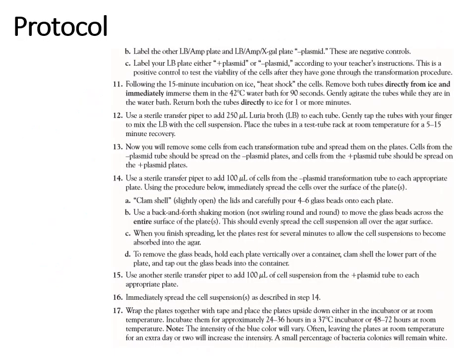We then have the remainder of the protocol. You notice that in the written out area, you'll see the heat shock that we talked about in the picture and all the other steps. You'll also notice the final incubation and the various selective plates that you will use. And I want to point out one thing on this protocol.